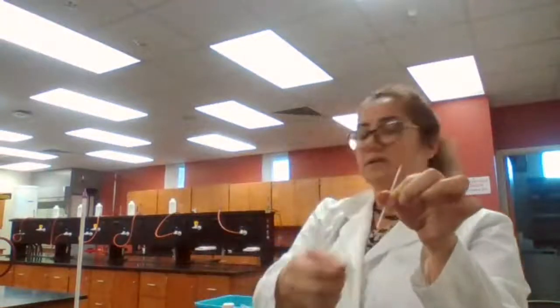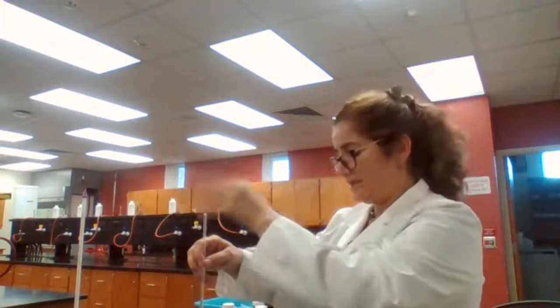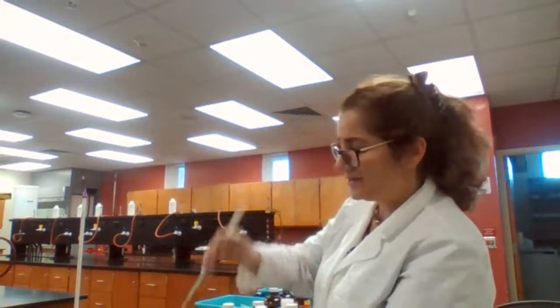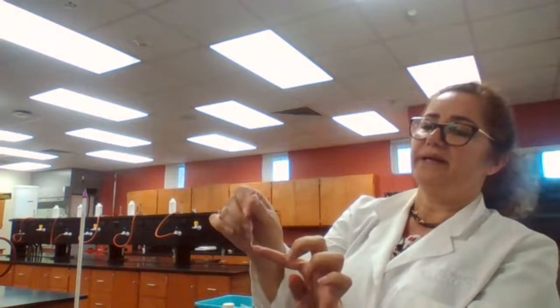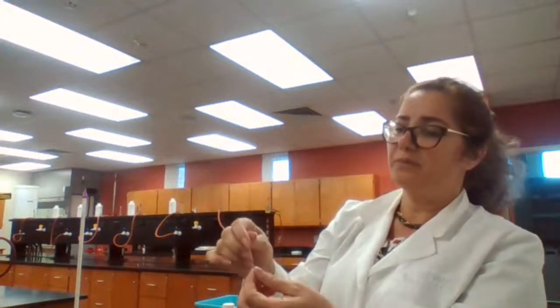I don't want to have any air bubbles in here, so I want to make sure that the packing is efficient and we get a packed sample here. We don't want air, because if we have air here, air is going to prevent the even distribution of the heat, and then one part of the sample is going to be melting before the other part of the sample melts.